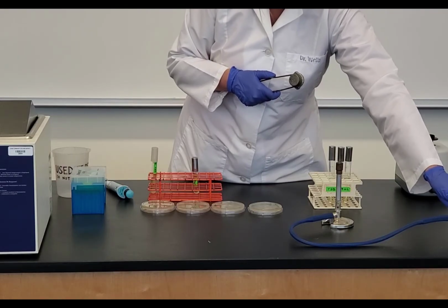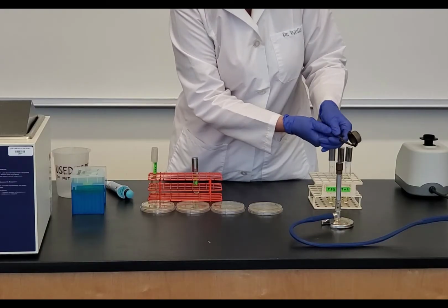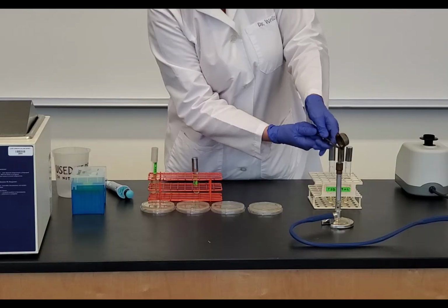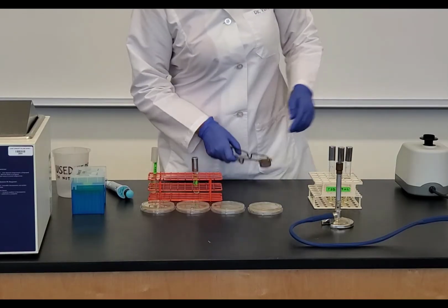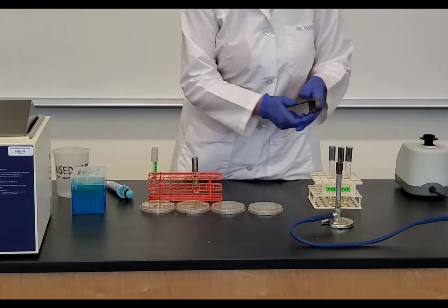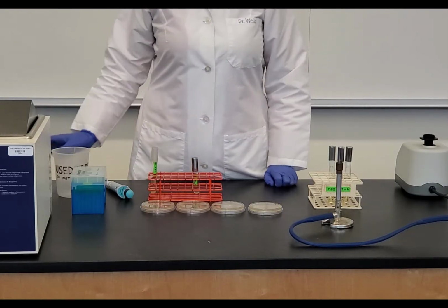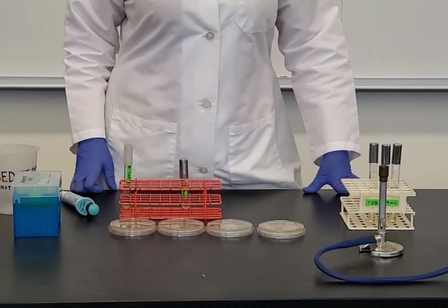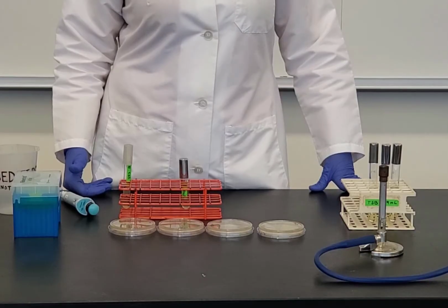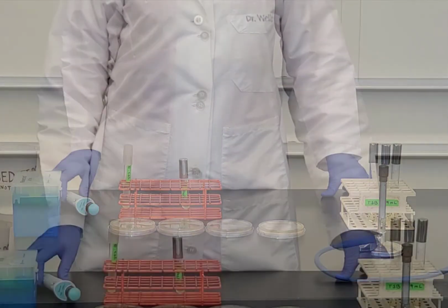Once I hear that, I close the gas a little bit. Still too high. So we have a little bit of a draft in here. There we go. So there's our Bunsen burner lit. And so you can see that we have our inner cone. That is the hottest part of our flame. So we need that in order for us to sterilize items.